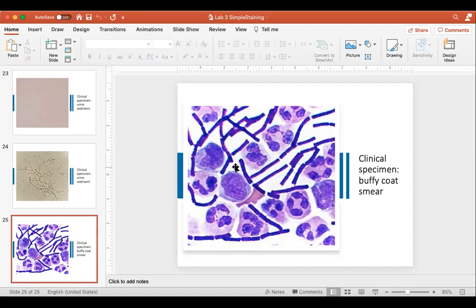Do you think this patient is sick? Yes, that's a lot of white blood cells. Well, it's a lot of white blood cells, but it's also a lot of bacteria in the blood, right? Bacillus. Oh, okay. Can I ask another question? What does the root of bacillus mean?